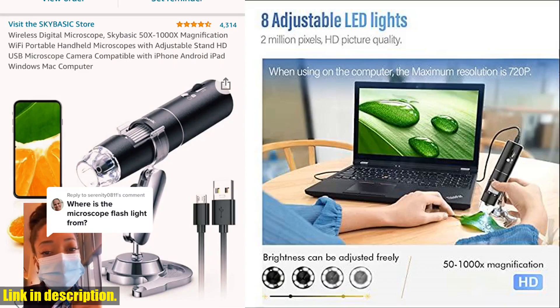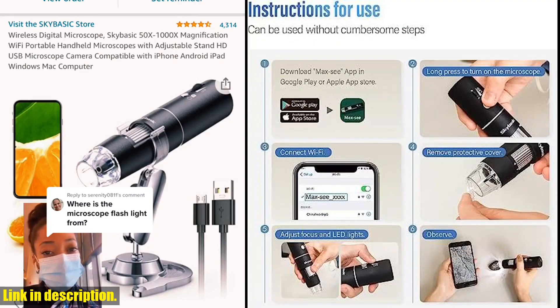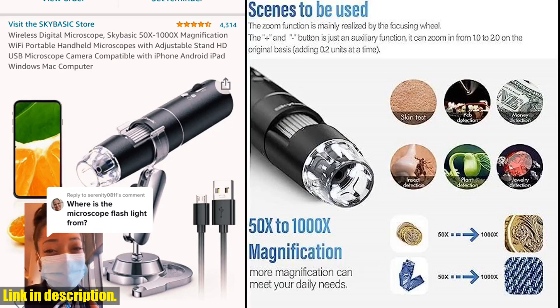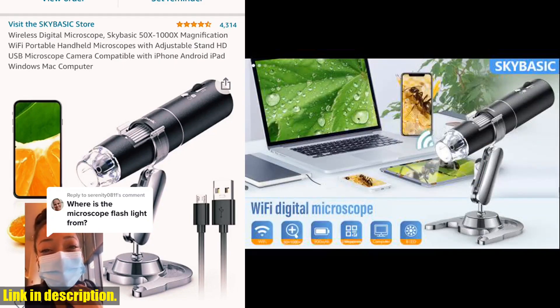It's super easy to use. Simply connect to your device via Wi-Fi or USB, and you're ready to start taking photos and videos with the touch of a button. And with great compatibility with both Android and iOS systems, as well as Windows and Mac, you'll have no trouble getting started.